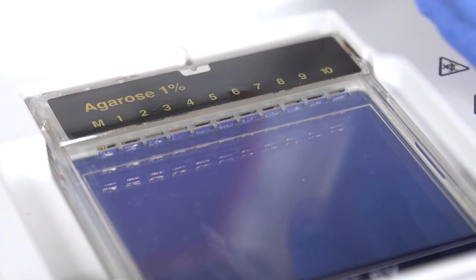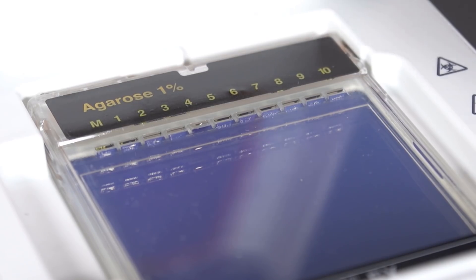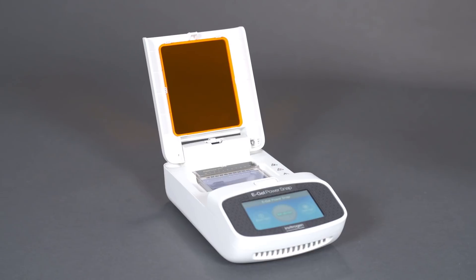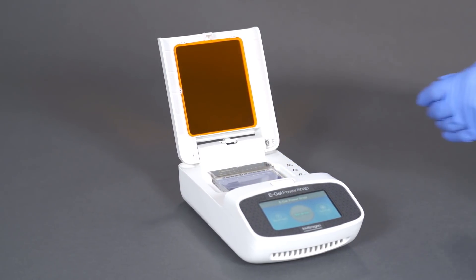Load 20 microliters of prepared sample or the appropriate molecular weight marker into the sample well. For the best result, use Invitrogen eGel DNA ladders designed exclusively for eGel systems.